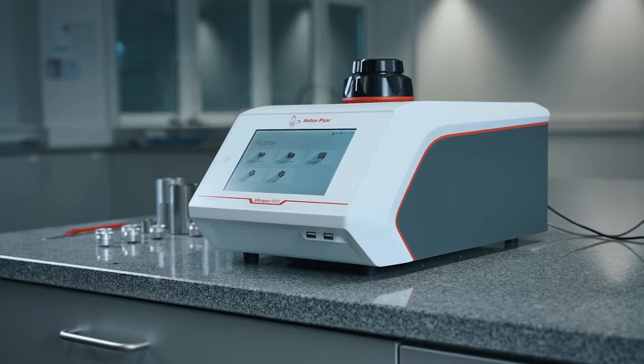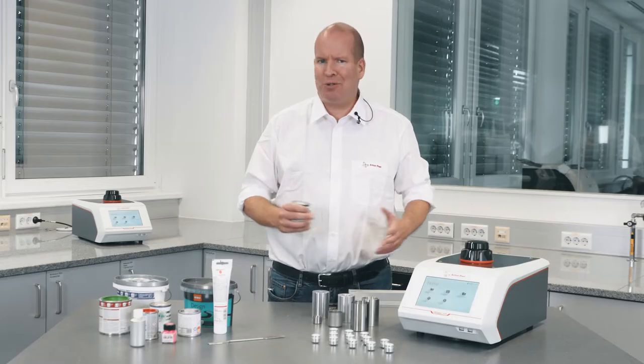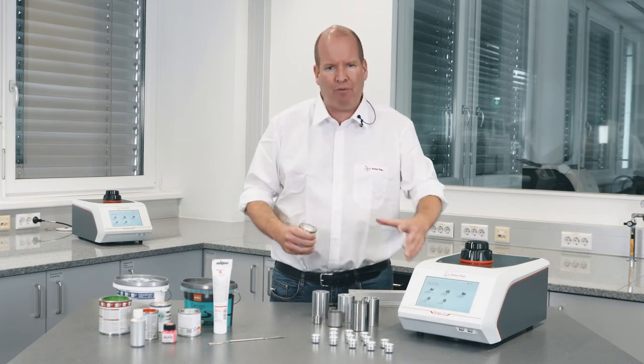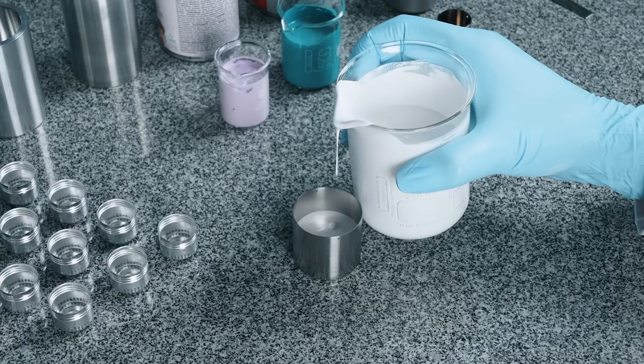Anton Parr's Ultrapyc 5000 measures the density of water-based paint, oil-based paint, or paint primer with ease. No struggle with sticky, hard-to-load samples — just scoop the sample out from the jar or squeeze it out of the tube. Transferring or loading it with the wide measuring cups is straightforward.